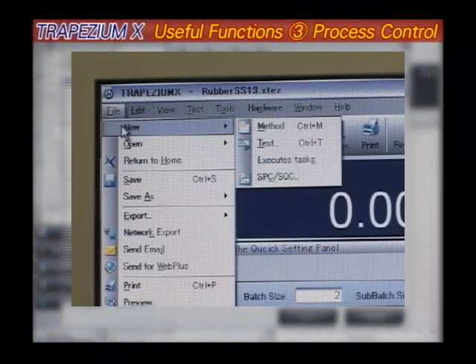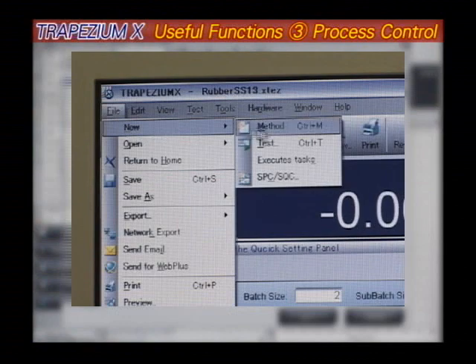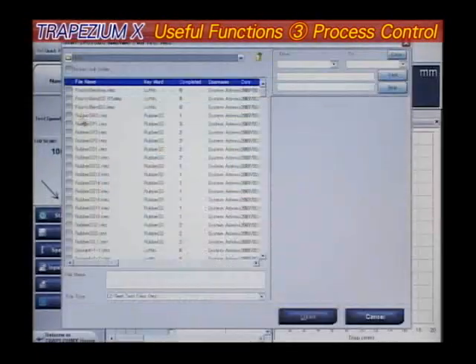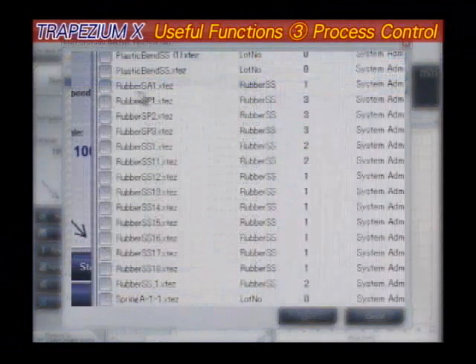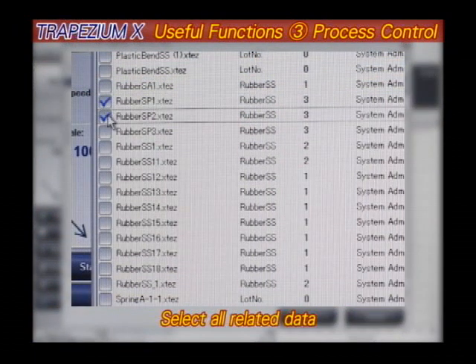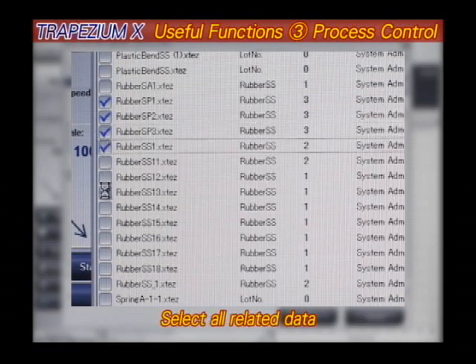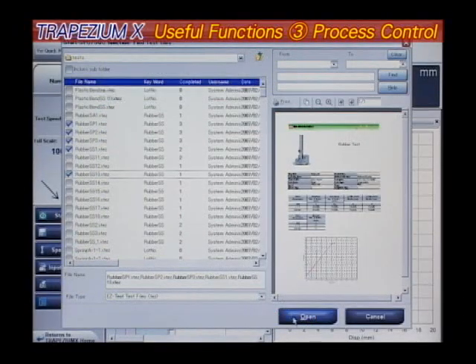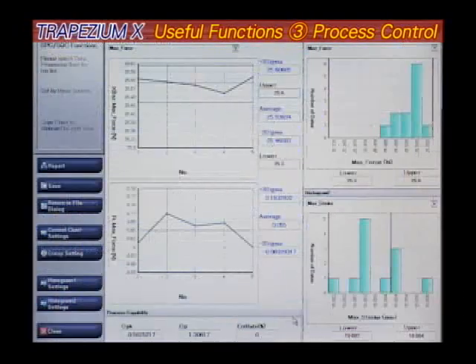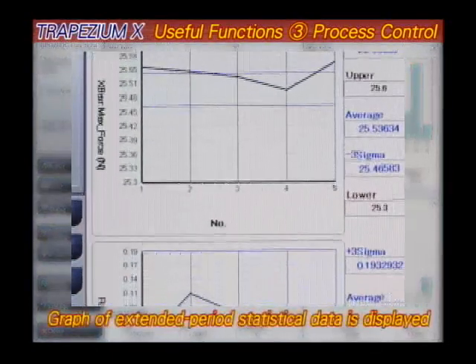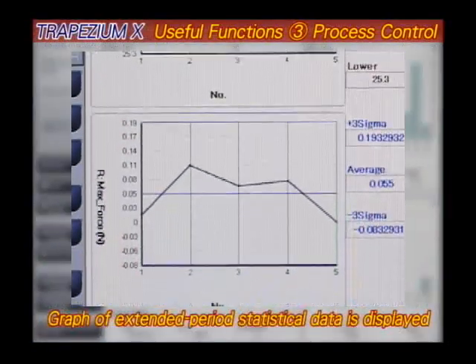Process Control Function. For tests extending over a long period, a comprehensive understanding of test data is vitally important. With Trapezium X, it is now possible to statistically graph and analyze data spanning an entire period.